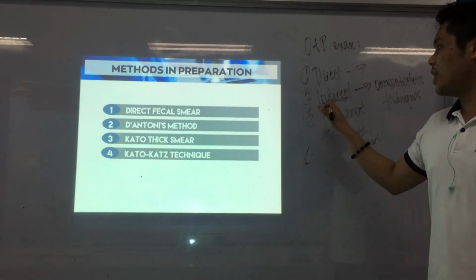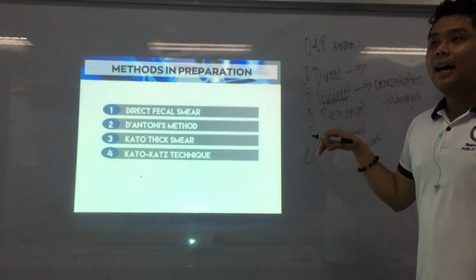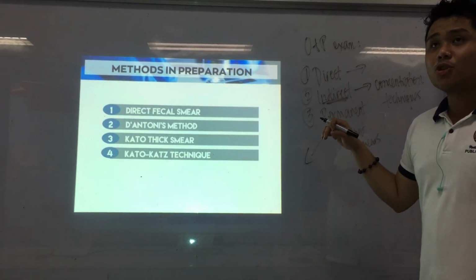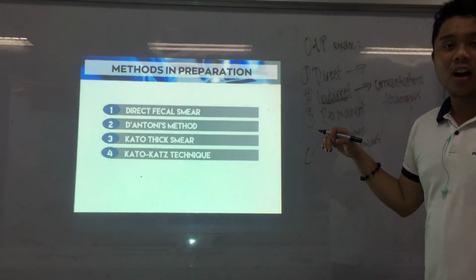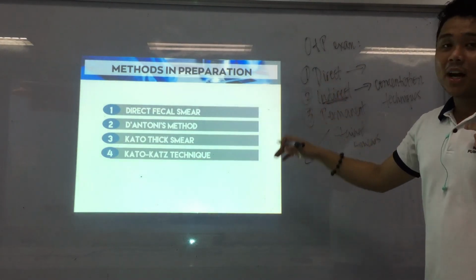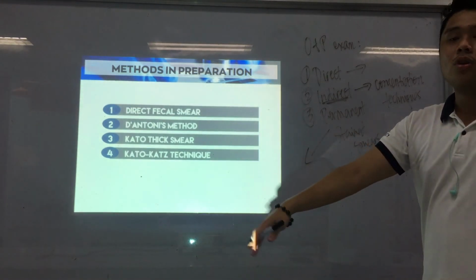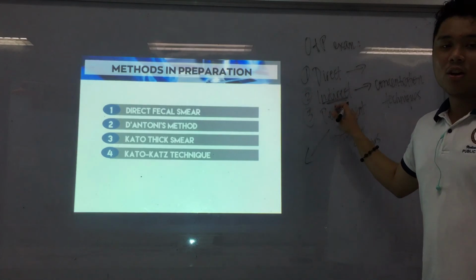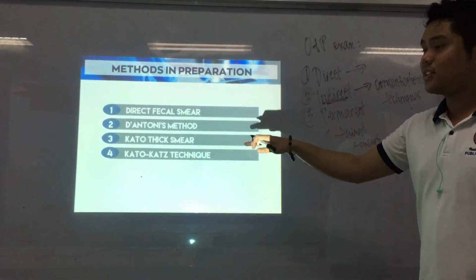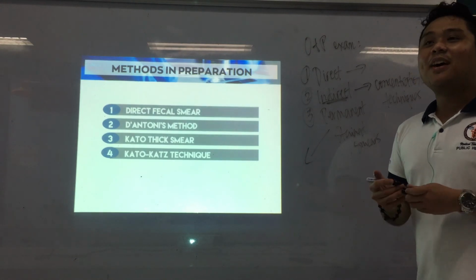So what they do is perform concentration techniques, because usually the stool specimens there are preserved. We cannot perform a direct wet mount if it's already preserved, so they subject that to concentration techniques. So again, these are the different methods in preparing a fecal smear.